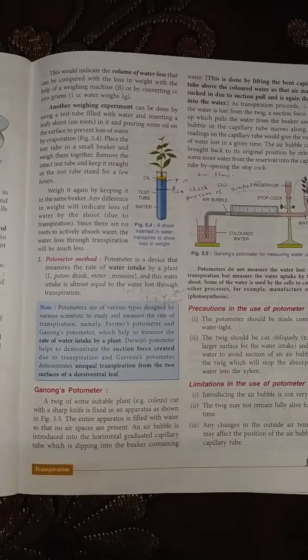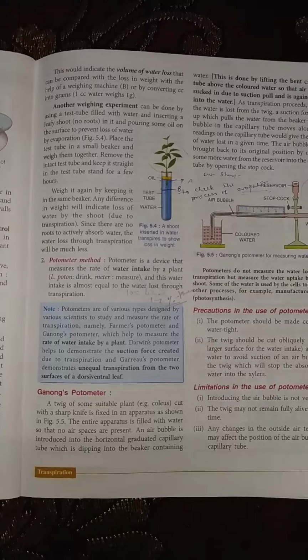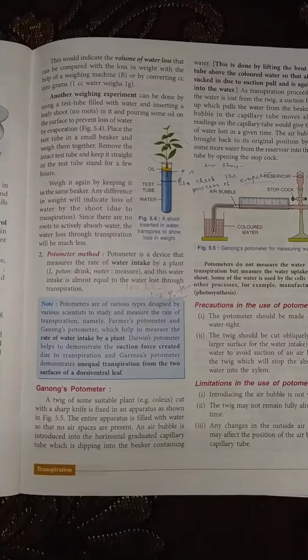It is used to measure the amount of water absorbed by a plant or a plant shoot, and we can consider it equal to the water lost through transpiration.